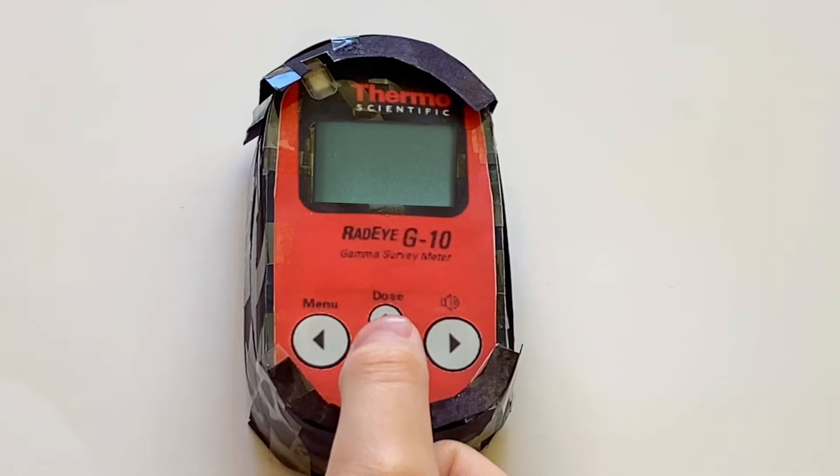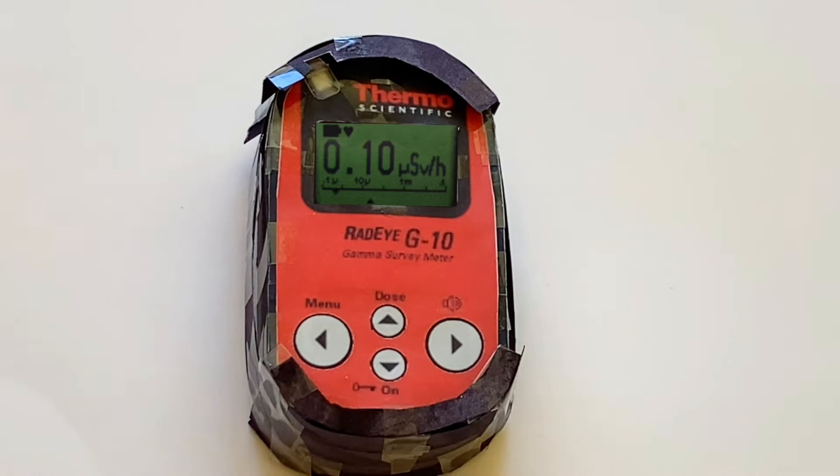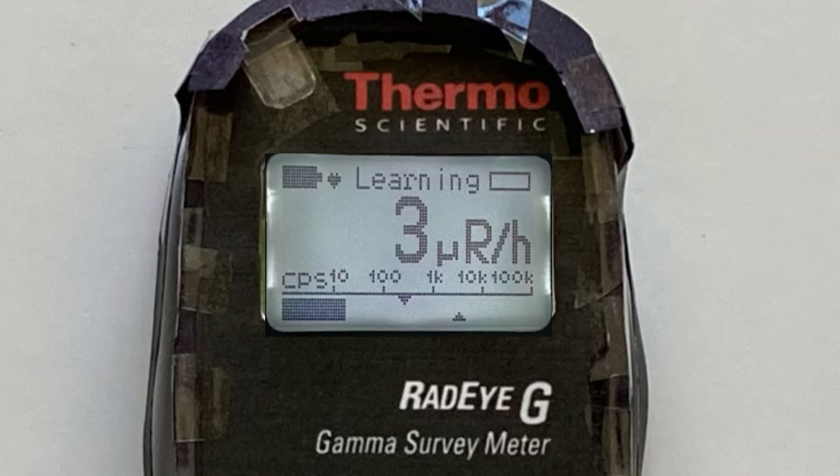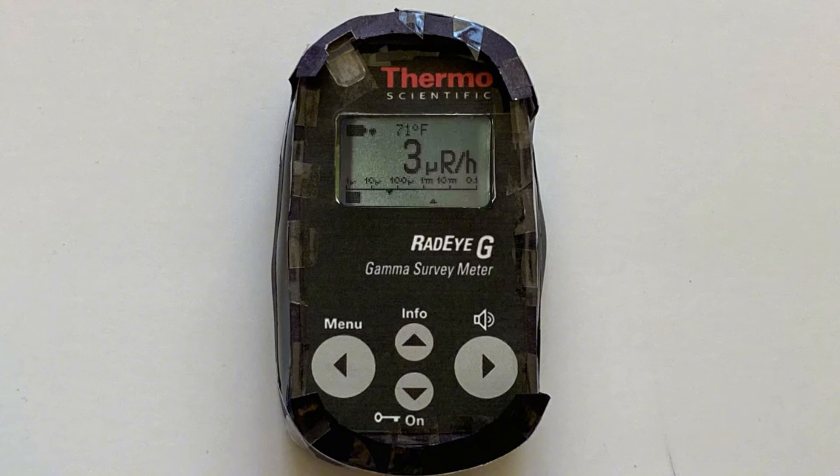Now, long press the key-on button to turn the instrument on. The details such as the last calibration date will appear on the screen until you release the key-on button. After initial power up, 'Learning' will appear on the screen. Do not use the instrument until this message goes away.